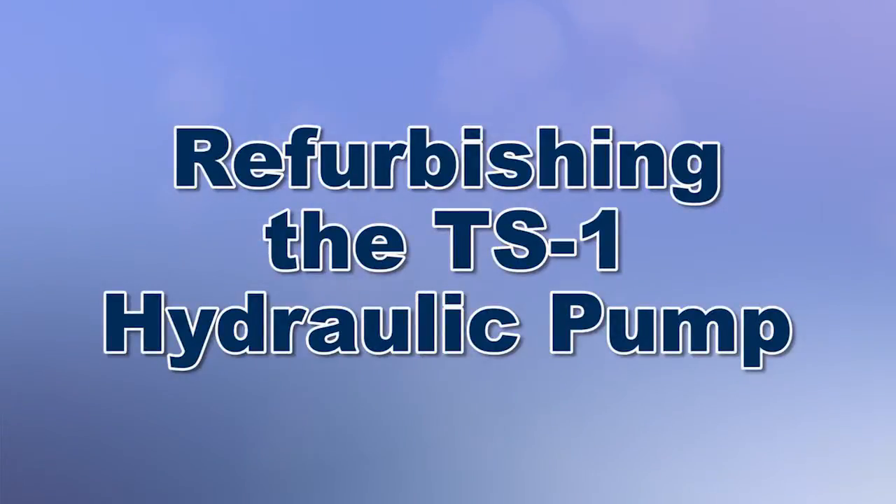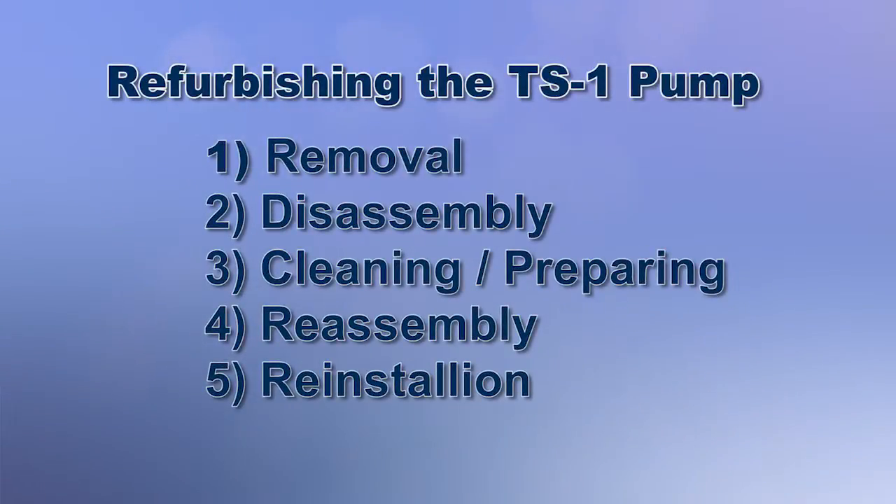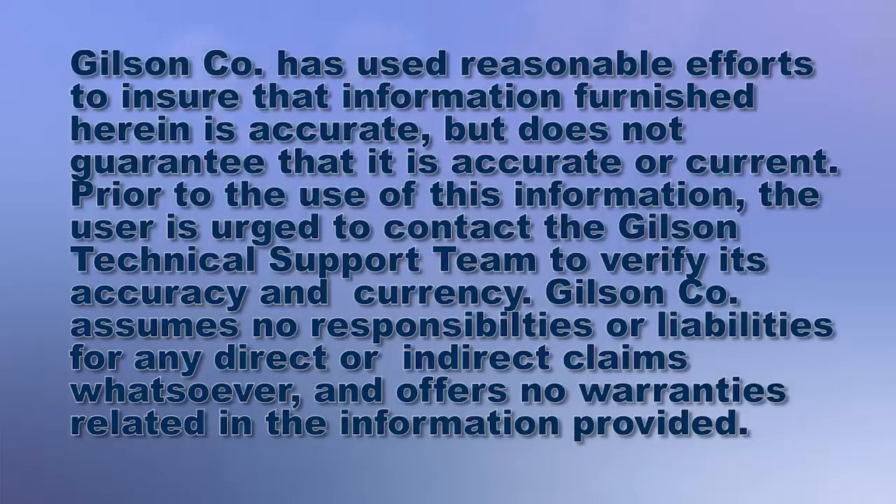Today we're going to demonstrate how to refurbish a TS1 testing screen hydraulic pump with Gilson's pump repair kit number two, which contains all the internal parts needed to return the pump to working operation, making it a very economical choice to extend pump life.